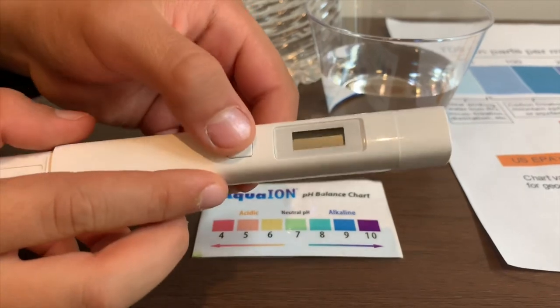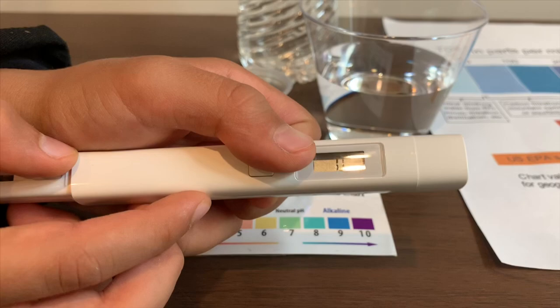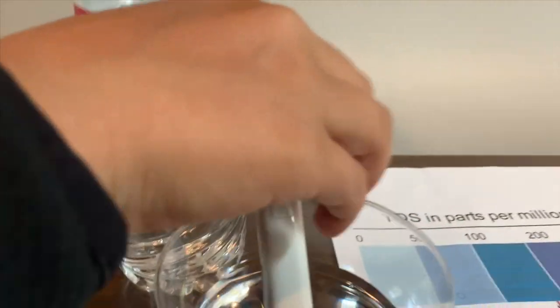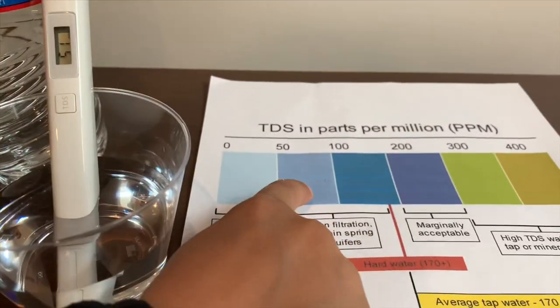If you want to buy this TDS tester, check the link down below. Turn on the TDS tester, make sure it says zero and put it in. 51 — that is okay to drink.